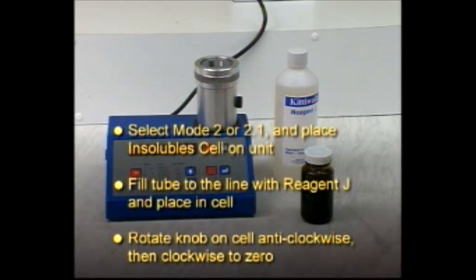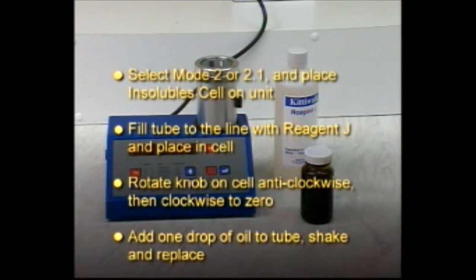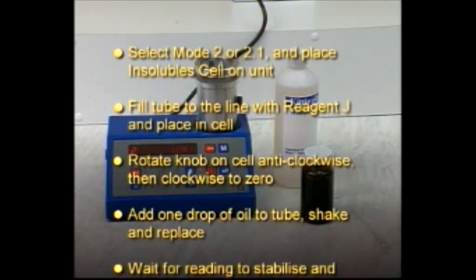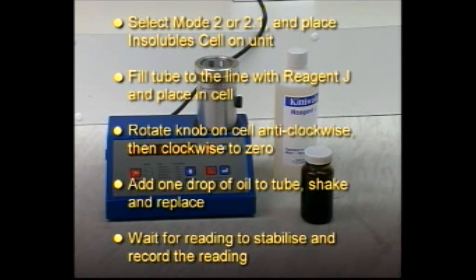Rotate the knob on the cell anticlockwise, then clockwise to zero. Add one drop of oil to the tube, shake and replace. Wait for the reading to stabilize. Record the reading.